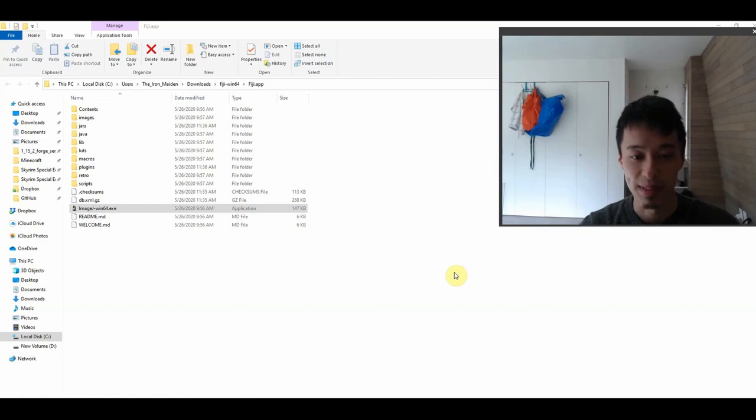And this is important because we can then use these pixels that correspond to each cell and then average across the pixels to obtain time series and activity signals for each cell, or ROI.